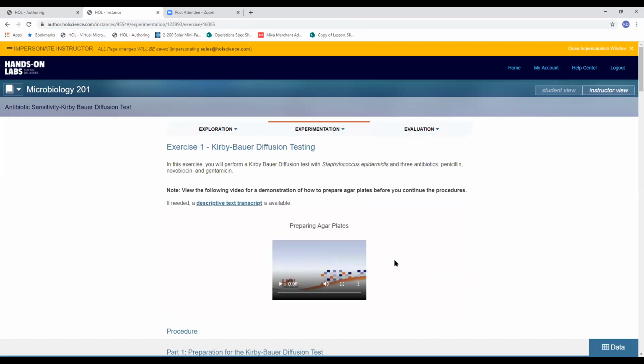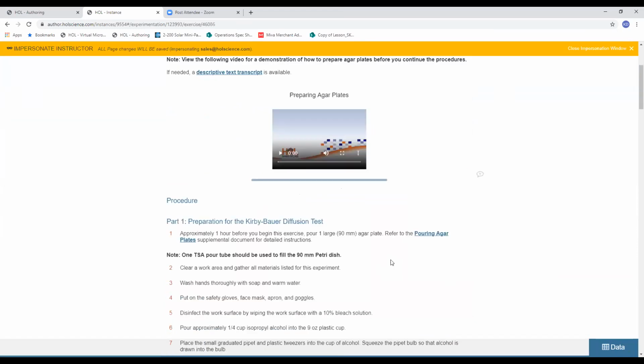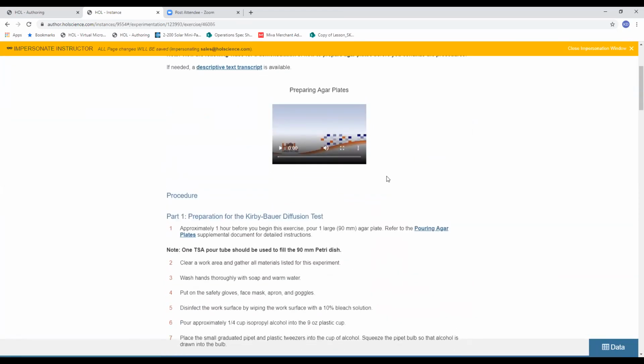And maybe you wanted to add a supplemental video, not unlike ones we already have, that maybe is taping you, their instructor, performing the procedures. So you could really set up a nice visual demo for your students. Again, on these procedural pages, you will see the pulsing blue bars, and you have the same options: text, images, or videos.